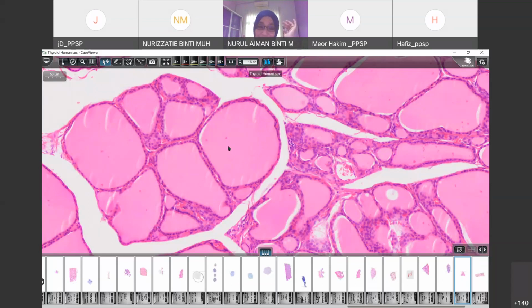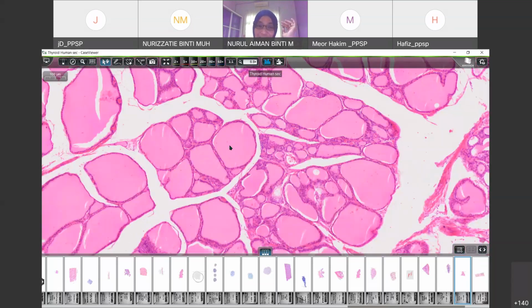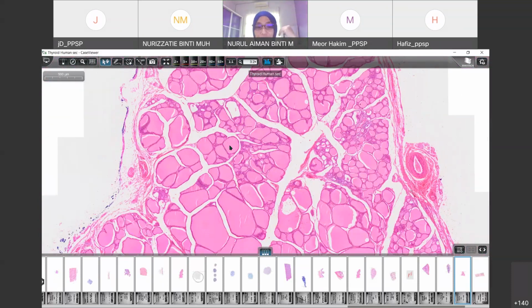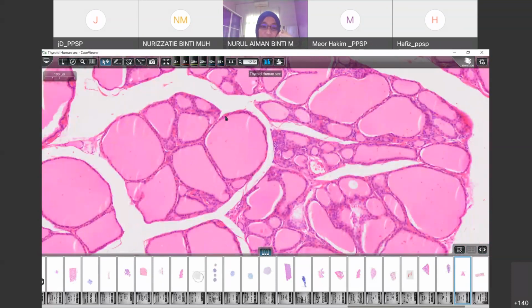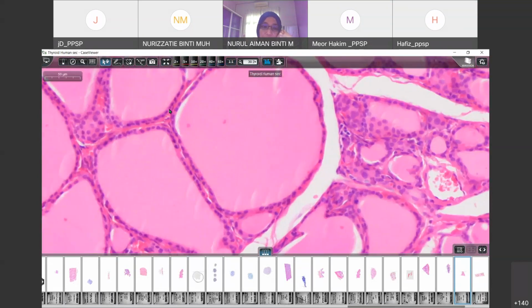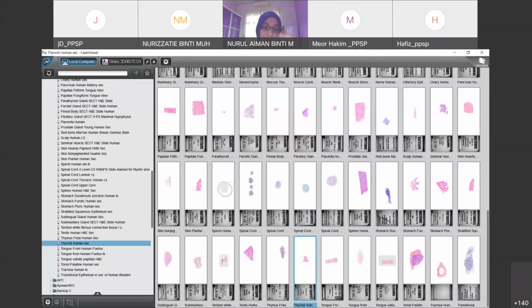That is under endocrine. I'm not going to teach you today. Each lecture on the glands may have two endocrine glands in one hour, but in histology they clump them into one lecture. The characteristic feature of the epithelium of the thyroid gland is that it is sometimes cuboidal and sometimes changes to columnar, depending on the activity of the thyroid gland. These are the thyroid glands, just for your interest to look at.